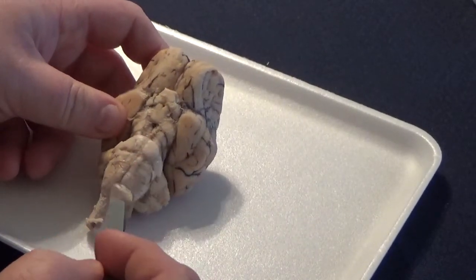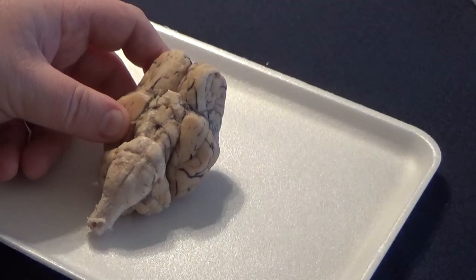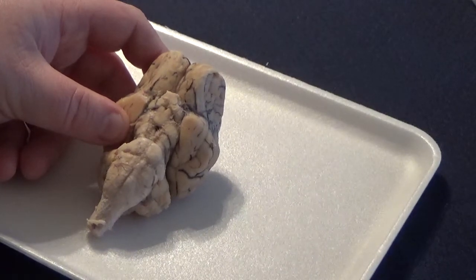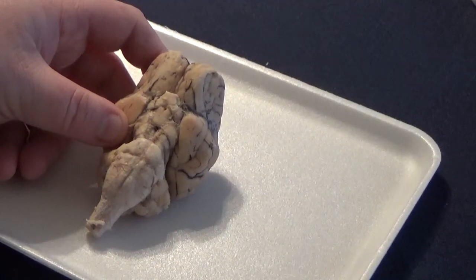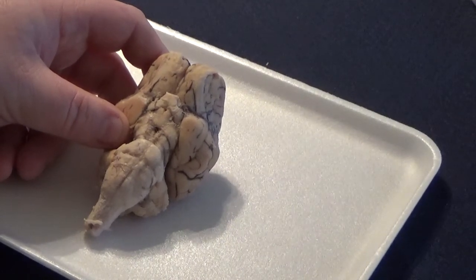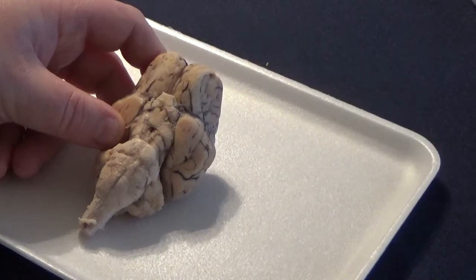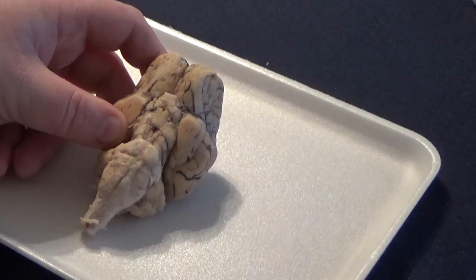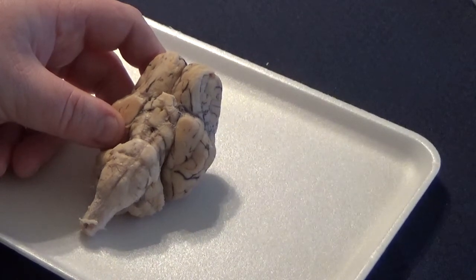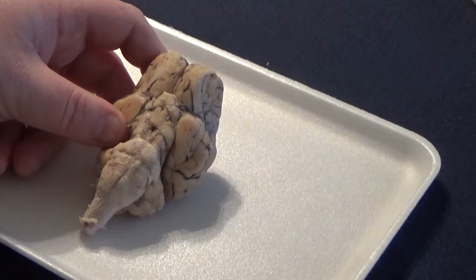Beneath the pons is this structure here called the medulla oblongata. The medulla oblongata controls breathing and heart rate. It's the part of the brain that tells your heart to keep beating and your lungs to keep breathing. Your heart doesn't breathe, silly me. So it controls your heart and your lungs, and your heart beats and your lungs breathe. Try not to get those mixed up like I did.